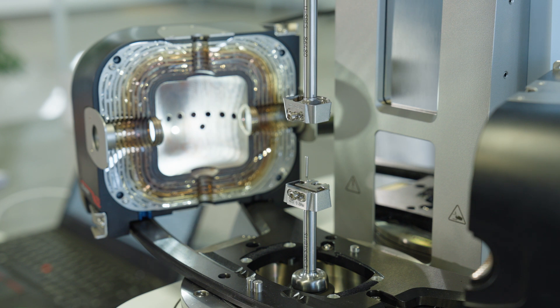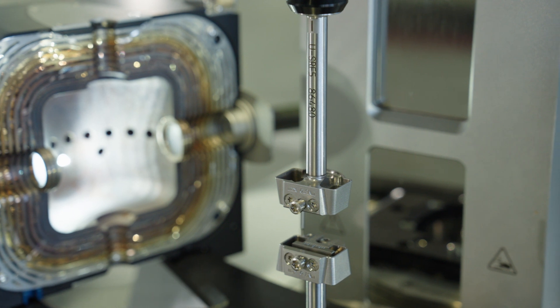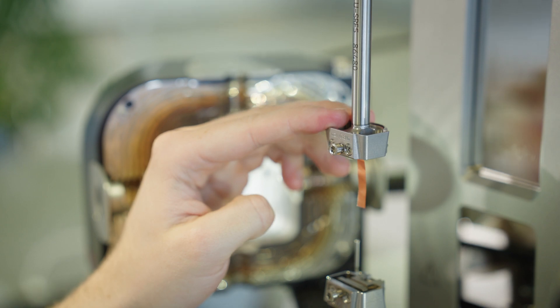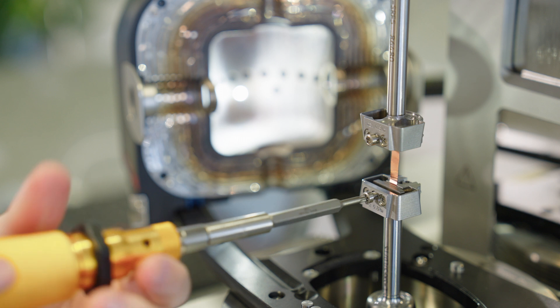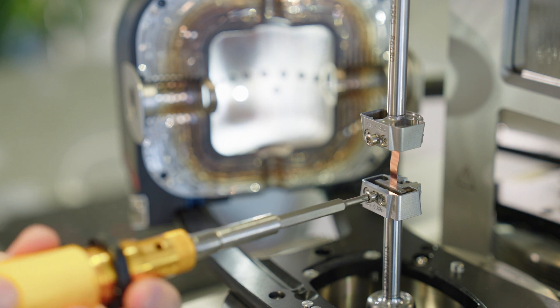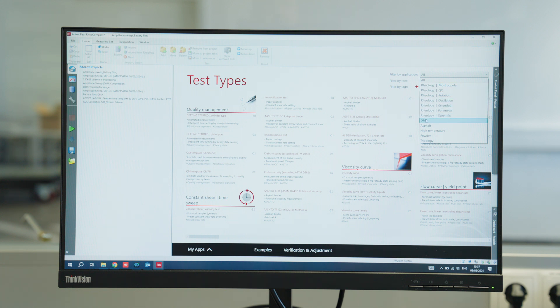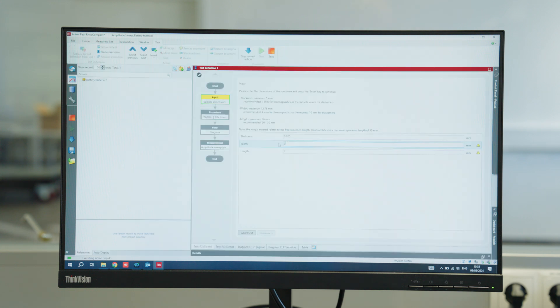For the DMA in tension of the separator film, we will place the sample in a sample holder, which in this case is a solid rectangular fixture. Prior to the temperature ramp, an amplitude sweep has to be performed to determine the linear viscoelastic range of the material. This is necessary to generate valid measurement data. This can be done by going into the software and opening the template under the section amplitude sweep, called linear viscoelastic range. Enter the sample dimensions and conduct the measurement.